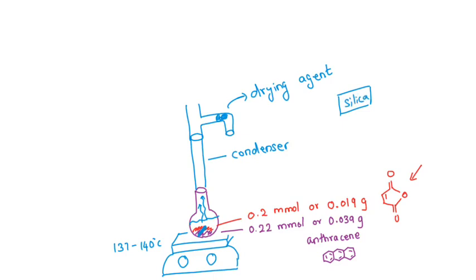That is a drying agent. Moisture will make your new shoes or electronics not good, so having silica will keep a dry, nice product. Like that, we have a drying agent here, calcium chloride, CaCl2, which absorbs the moisture.